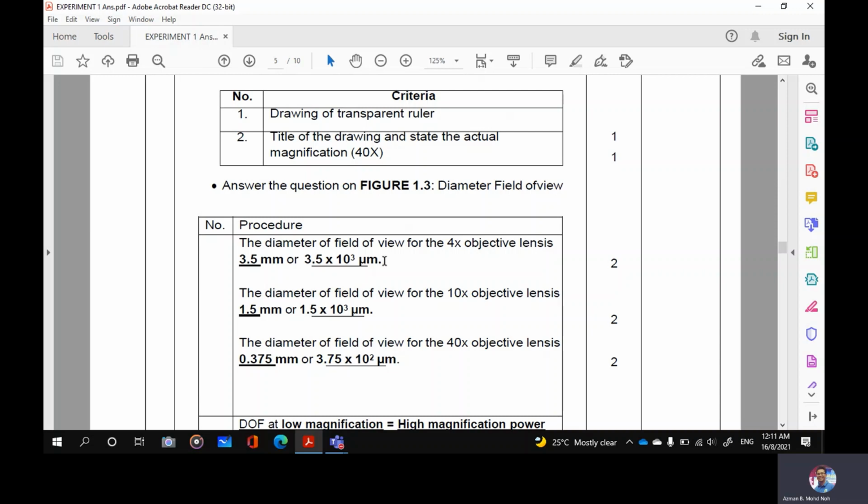So this depends on your observation. Maybe you can write 3.5 the same, or maybe 4.0, or maybe something else. This all depends on your observation when you look through your own microscope, or when you make your observation virtually using the matrix microscope board.